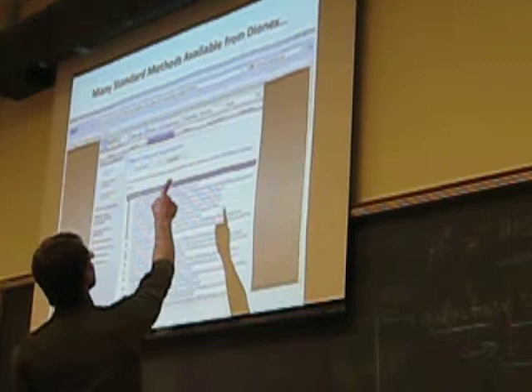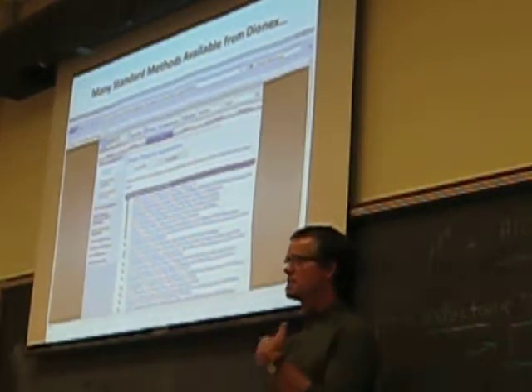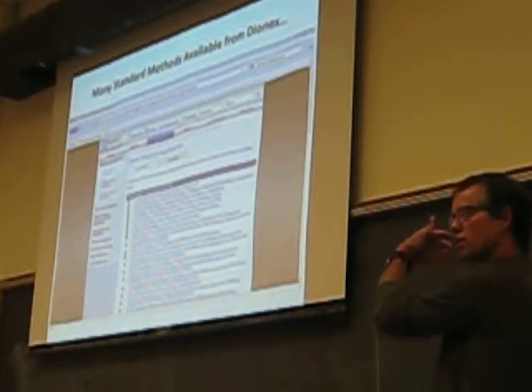And this is just a web page, probably a year or two old, part of it. Each of these is an application note for a different kind of method. Direct determination of fluoroacetate in water by LC-MS, sensitive online SPE HPLC determination of paraquat and diquat in drinking and environmental waters. So they spend time developing these methods, testing things, changing the parameters of their chromatographic methods in order to optimize applications. And then they write these up in nice little method papers and post them so that people like you or me could adopt one of these methods in the job I have to measure these samples.